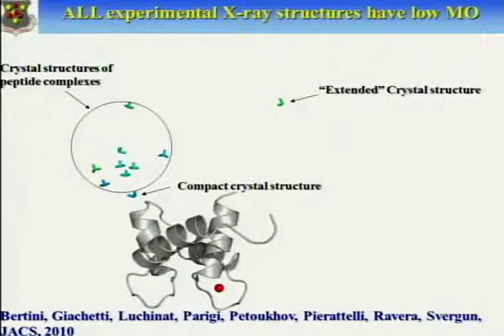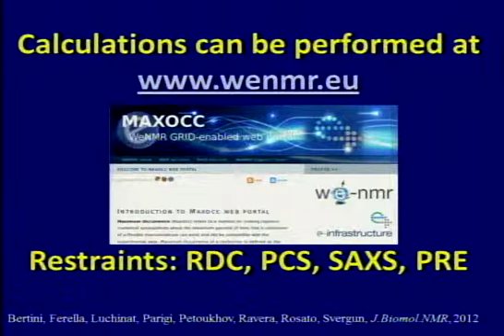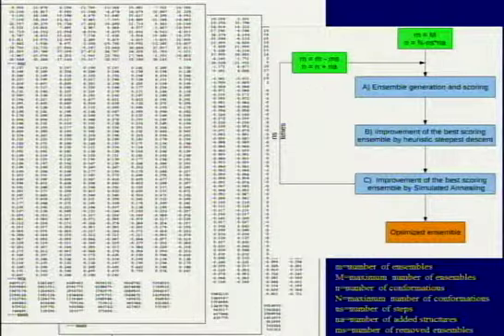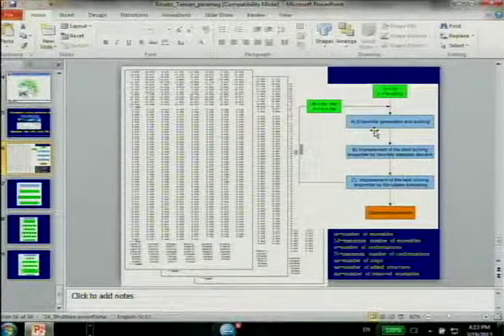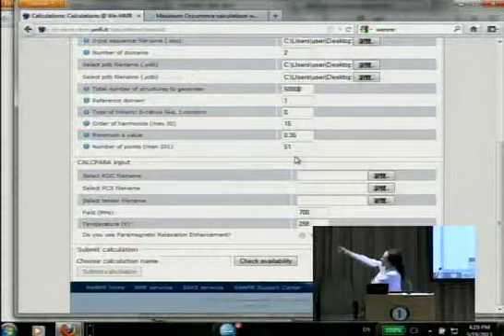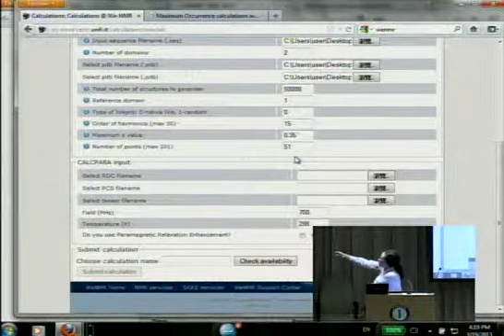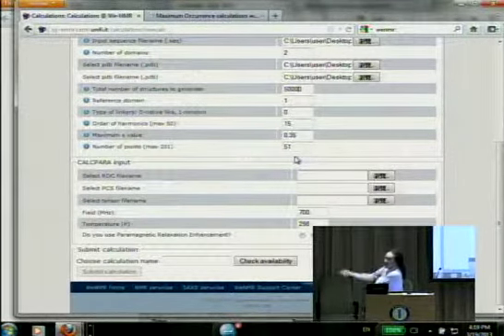So let's have a quick look at the port conformations, for example. The reference domain is the one where the metal was bound to, so in our case, it is the N-terminal domain. And then these are all parameters for the program that is generating these configurations.